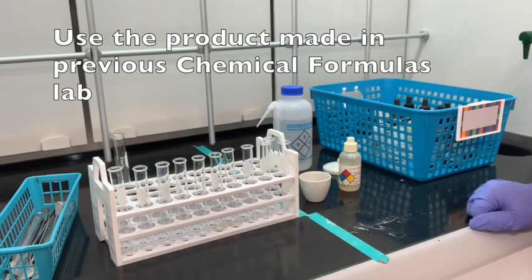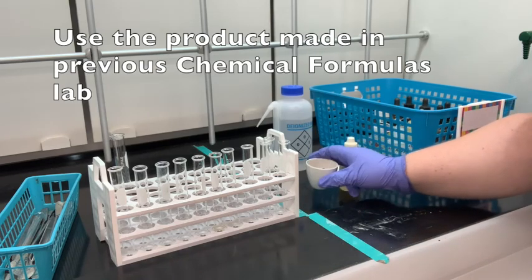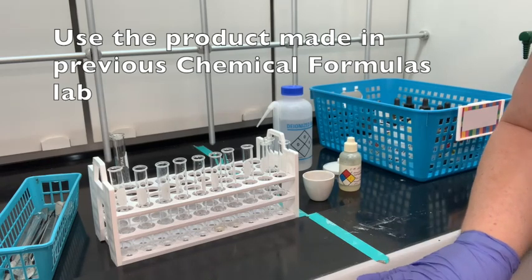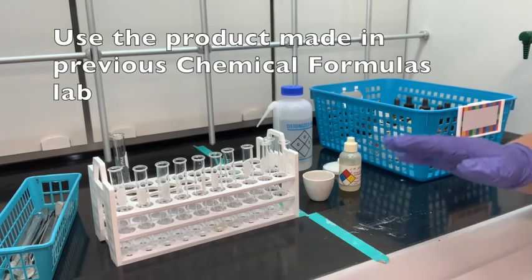We're not going to do that reaction right now. I already did that reaction this morning, and I have my copper sulfide here in my crucible. So we're going to use this and go through this reaction of copper and sulfur. This video will also include redox reactions, and then later on there will be a video for metathesis reactions. We'll do all of those inside the hood.